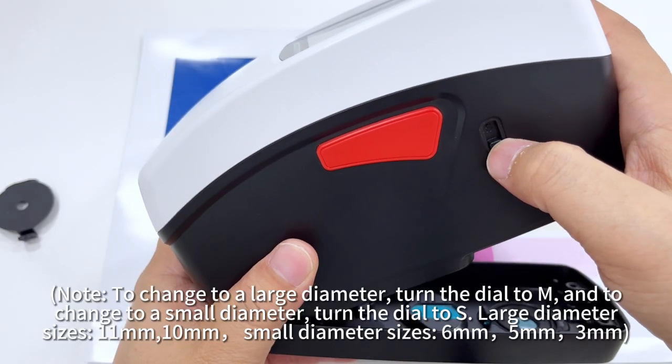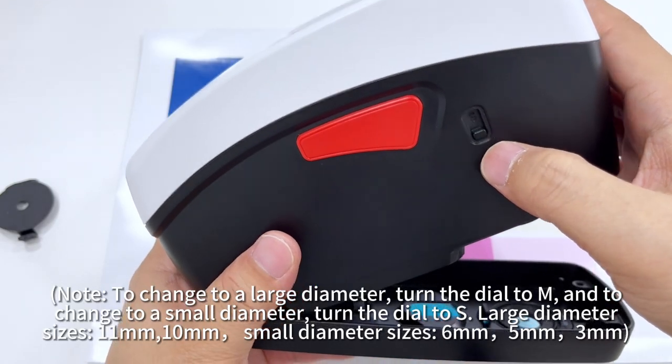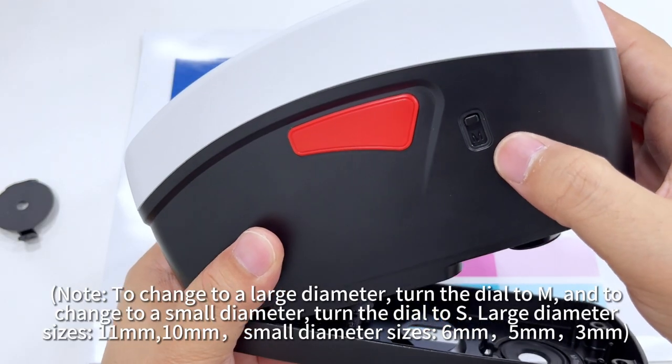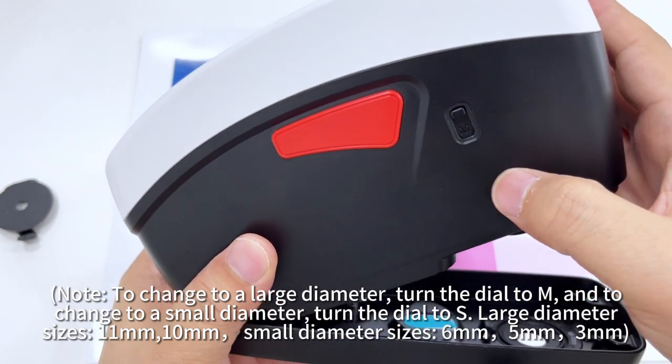To change to a large diameter, turn the dial to M, and to change to a small diameter, turn the dial to S. Large diameter sizes are 11 mm and 10 mm; small diameter sizes are 6 mm, 5 mm, and 3 mm.